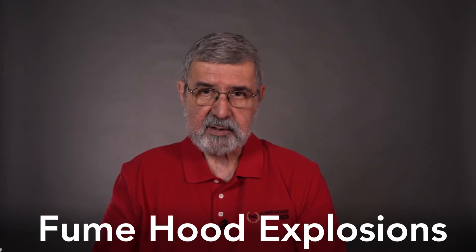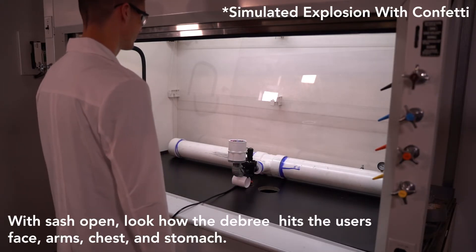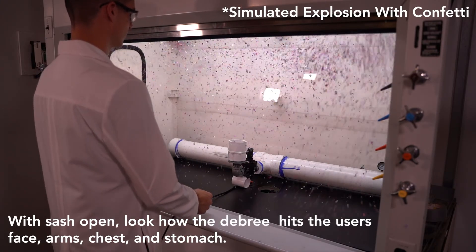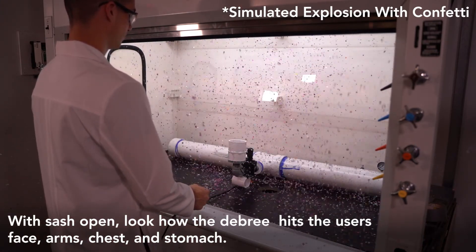Now let's talk about explosions — they come in all shapes and sizes and can be caused in many different ways, from a boiling beaker exploding to an explosion caused by flammable vapors. The most common byproduct of an explosion is shrapnel. In a fume hood, the most common shrapnel is broken glass, and with broken glass often comes chemical splashes. Again, the sash is there to be a barrier between the event and you.